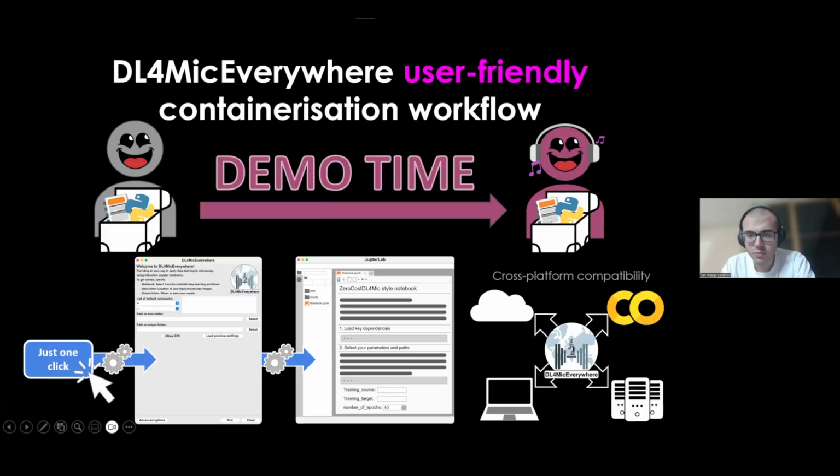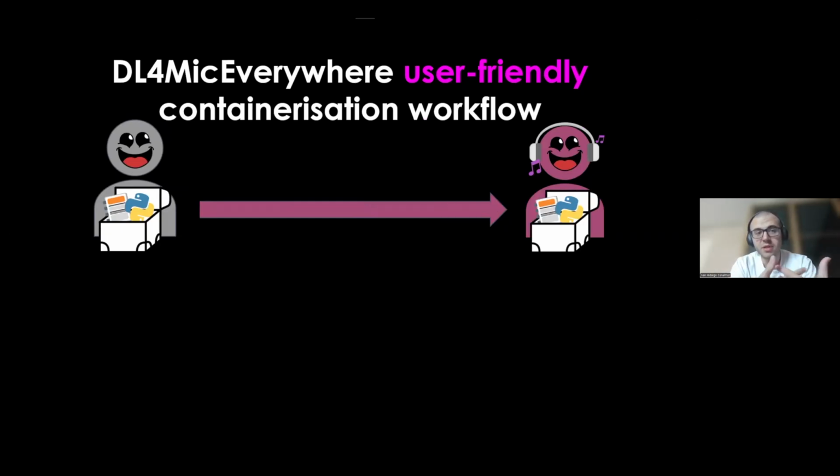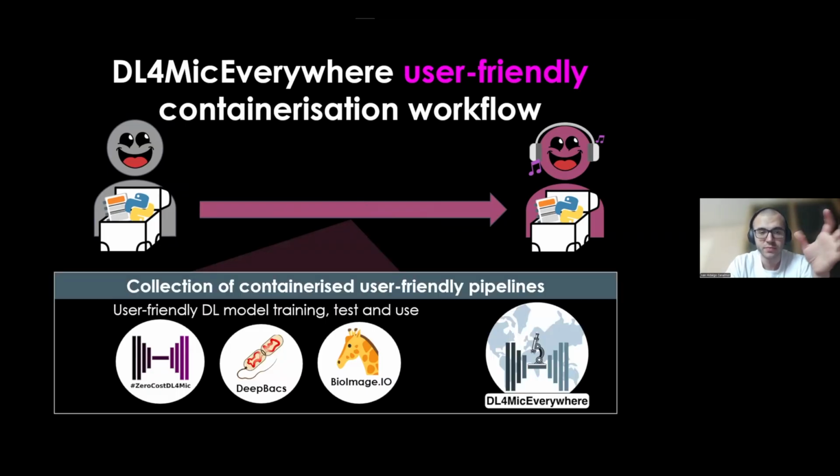So at the end, what DL4MicEverywhere does, from the developer's point of view, is try to give your notebook in a reproducible way to other users, but from the user's perspective, what you get is a collection of user-friendly deep learning models that you can train, test, and use.